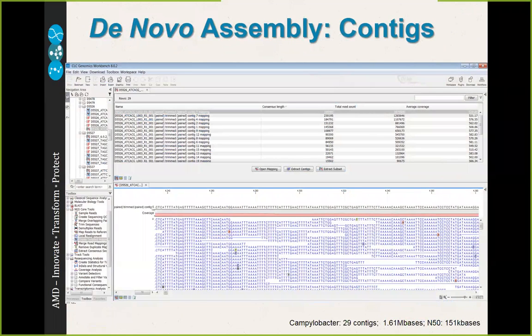In order to view the sequence information, there are computer programs the lab and bioinformaticians use. I've put up an example of how putting sequence reads together may look.